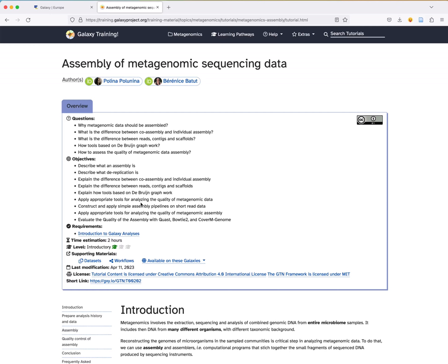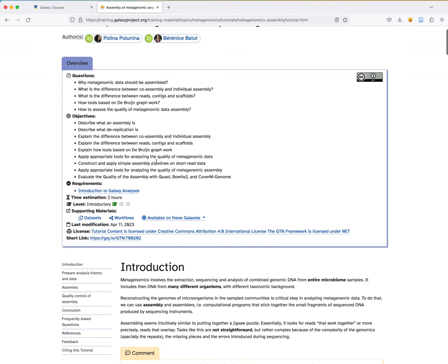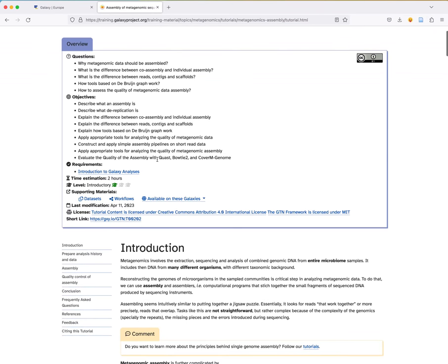This is the tutorial we will follow today. The idea is to answer questions about why metagenomic data should be assembled, what the difference is between co- and individual assembly, and other topics. By the end of the tutorial, you will be able to describe what an assembly is, the difference between co- and individual assembly, the difference between reads, contigs, and scaffolds, and how to select appropriate tools to assemble your data.